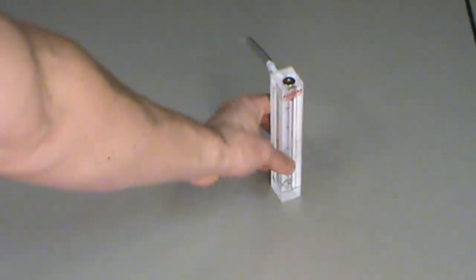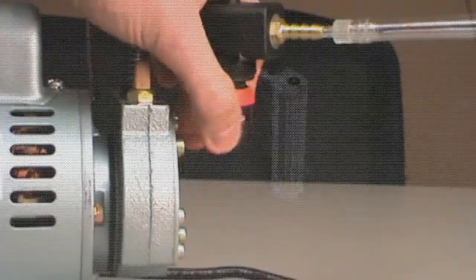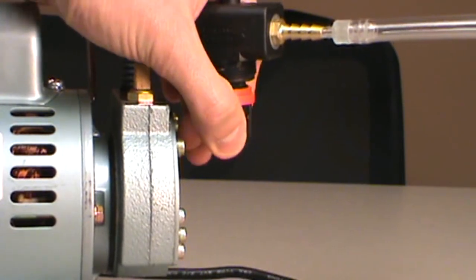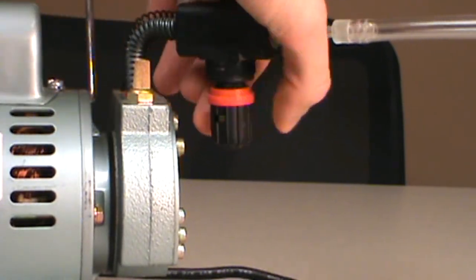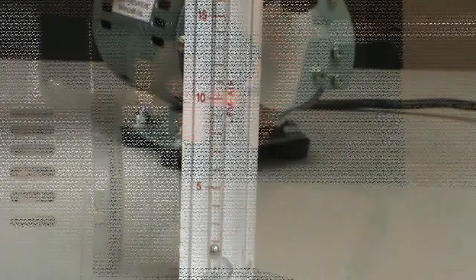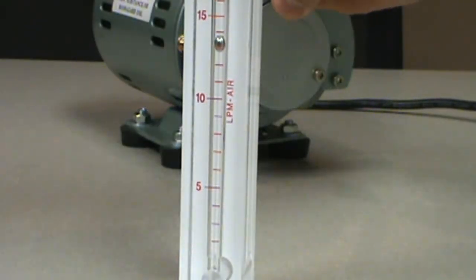You'll also need a flow meter to calibrate your vacuum pump. Turning counterclockwise increases the amount of air you pull, and clockwise decreases it. These mold cartridges perform optimally at 15 liters per minute.